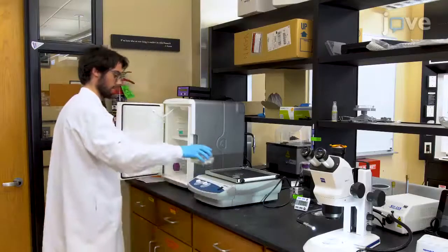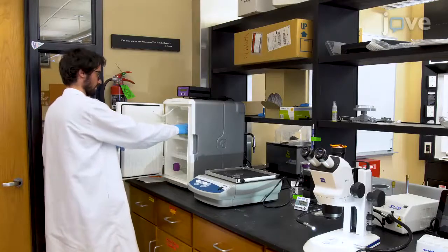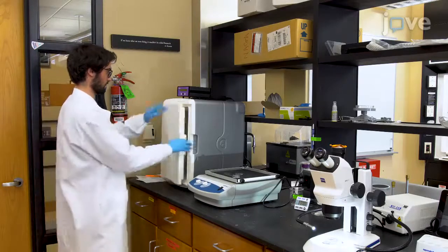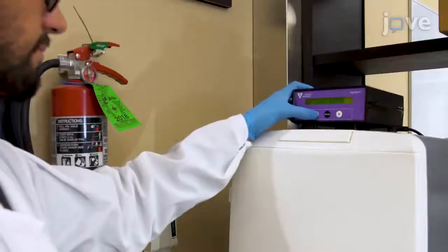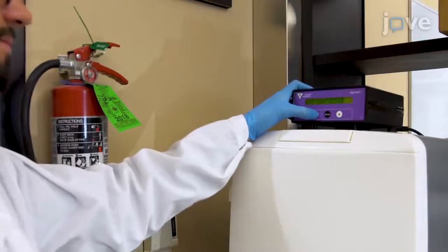On the day before spawning induction, place the anemone Nematostella vectensis in a temperature and light-controlled incubator, programming the incubator so that the animals are exposed to eight hours of light at 25 degrees Celsius.